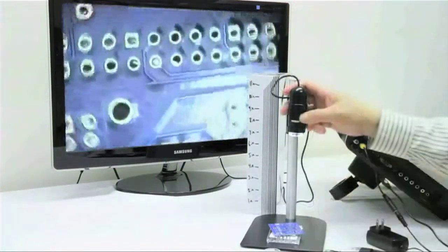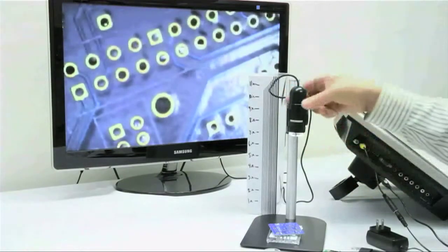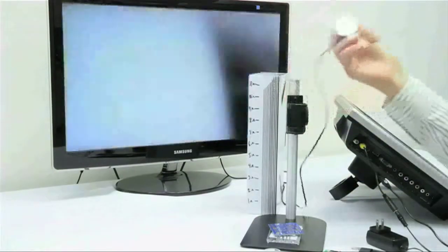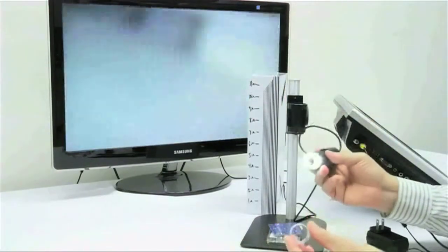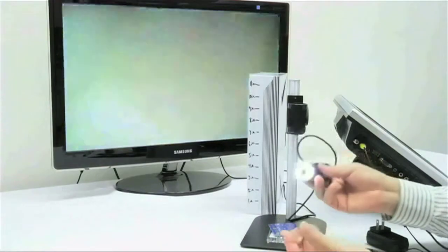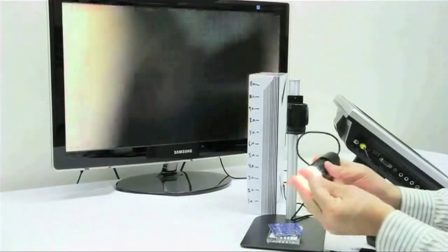The NTL comes with a sealed cap as well as an open face cap. The sealed snap-on cap is great for keeping dust, dirt, and debris away from the lens.